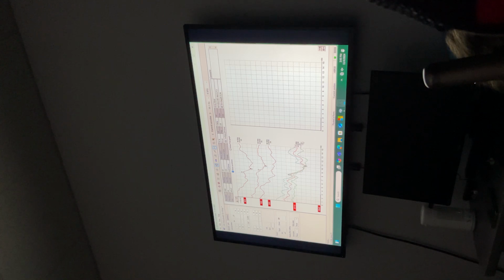So there's so much variability. In the previous recording, we averaged so much, we didn't see anything. Now we see such big response. So at 20 there is a response. You agree? Yes. So now let's write this.